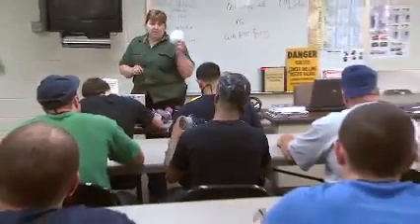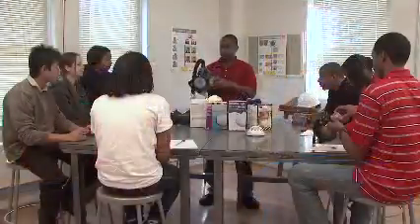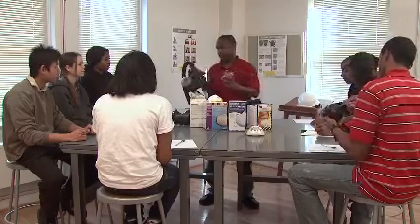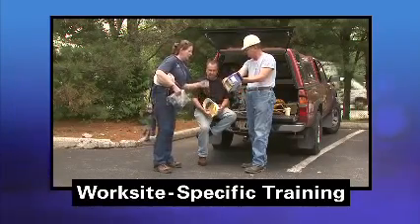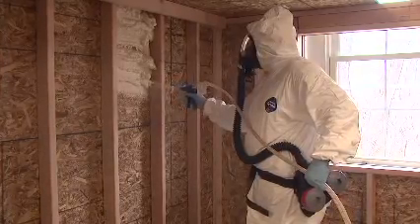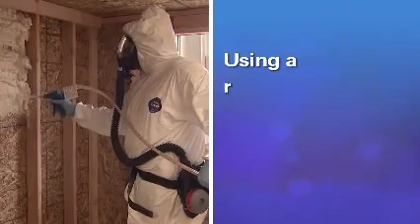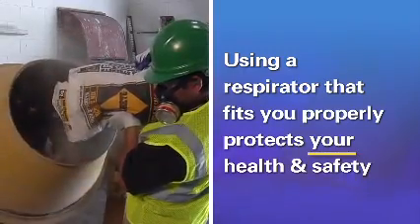This video can be a part of the OSHA-required Respiratory Protection Training, which includes many topics, like how to put on and take off a respirator and how to use, clean, and maintain your respirator. Your employer must also provide you with worksite-specific training. While this video discusses some of your employer's responsibilities under OSHA's Respiratory Protection Fit Testing requirements, it is important to remember that using a respirator that fits you properly protects your health and safety.